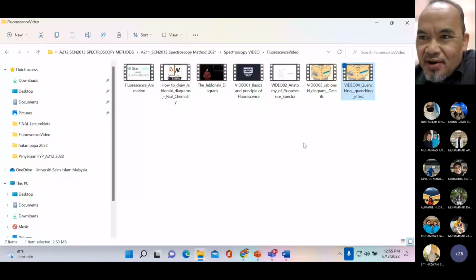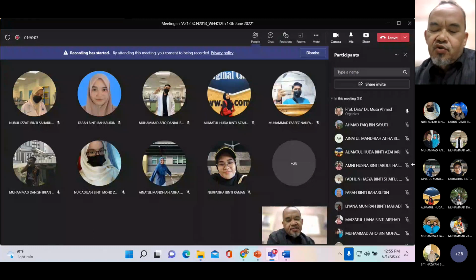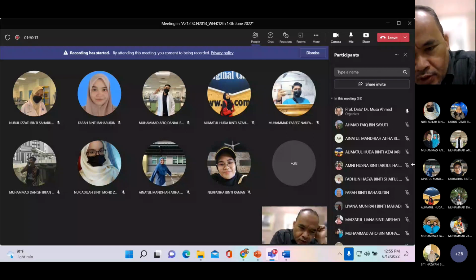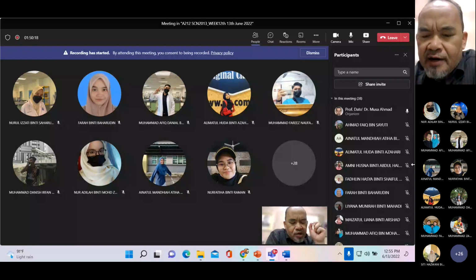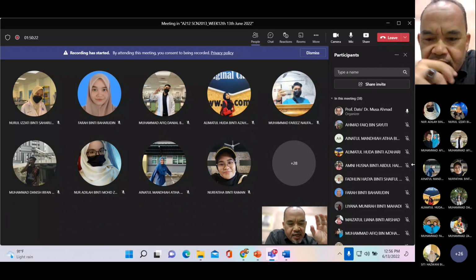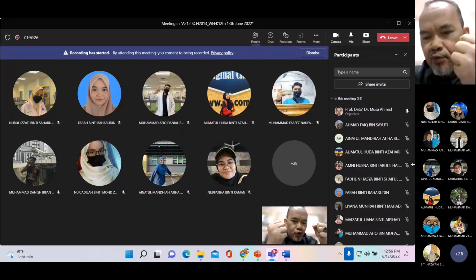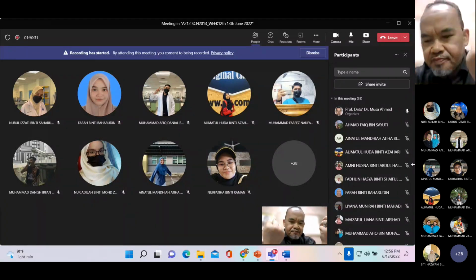Alright, okay, from this video, basically you can differentiate different types of quenching. And quenching is basically a phenomenon that occurs during fluorescence that reduces the fluorescent intensity. Okay, so just now they mentioned the concentration quenching. Concentration maknanya kalau larutan tu terlalu pekat. Seperti you prepare quinine tu kan pekat sangat. Okay, so dia akan ada self quenching because bila pekat sangat, there are too many molecules that are going to collide with each other, and during the collision tu energy will be wasted.